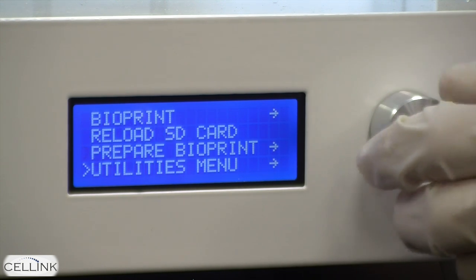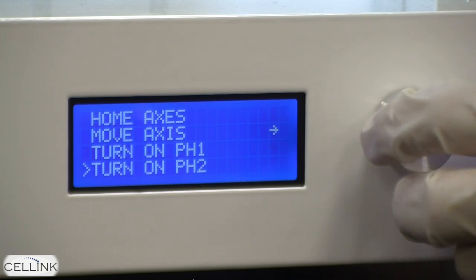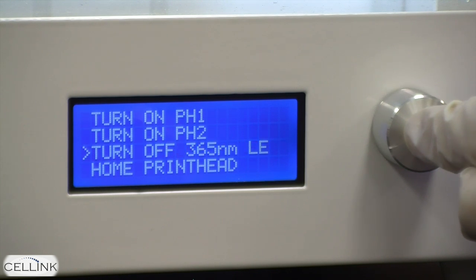In addition to this, we have the utilities menu. This includes many of the same options as the prepare bioprint menu, in addition to the ability to turn on the 365 nanometer LED, which is used when curing certain types of bioink.